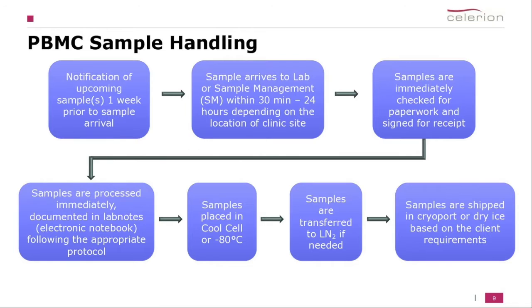If we follow our internal method, we have the appropriate bioanalytical method procedure already recorded in lab notes. If there is a client-specific method, we make a client-specific bioanalytical method procedure using the manual provided, and it will be sent to the client for review before uploading to lab notes.